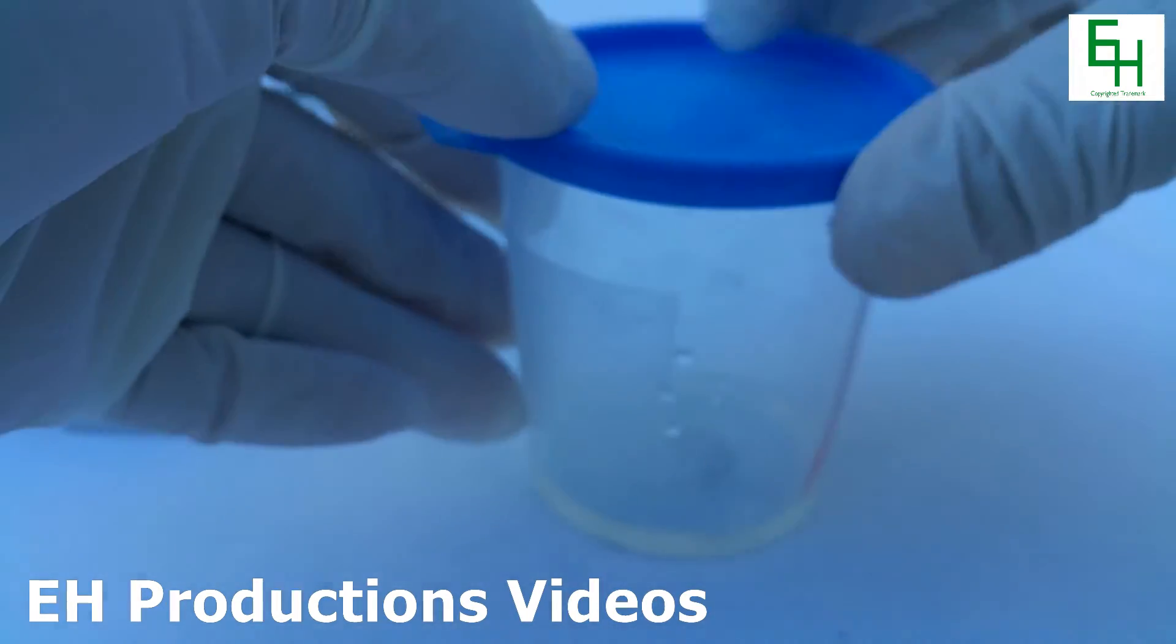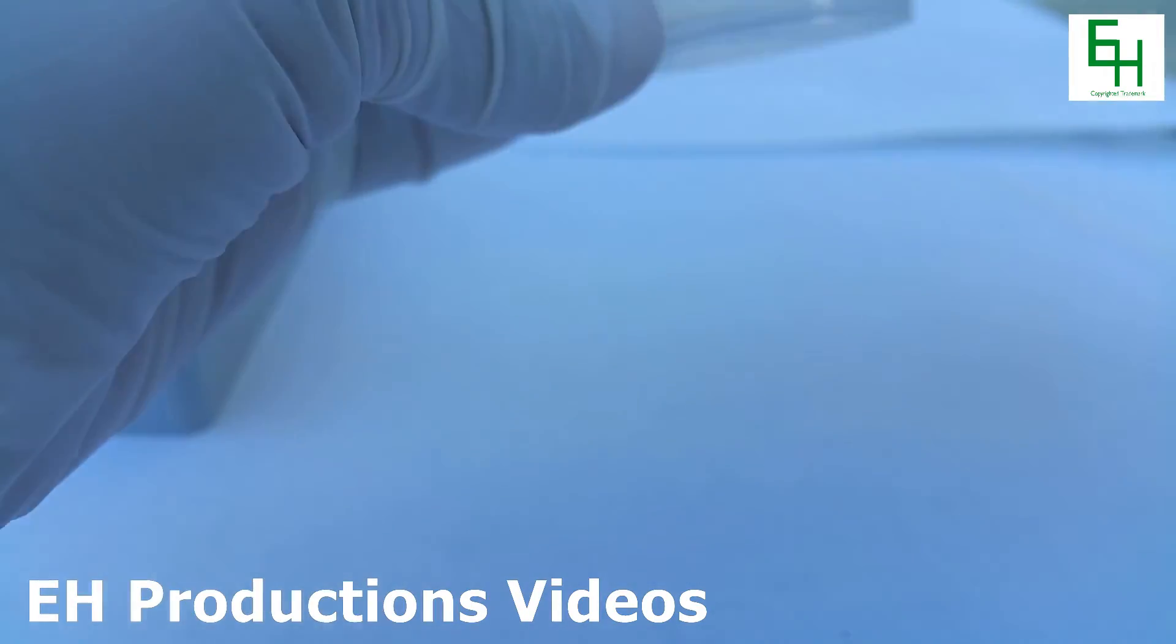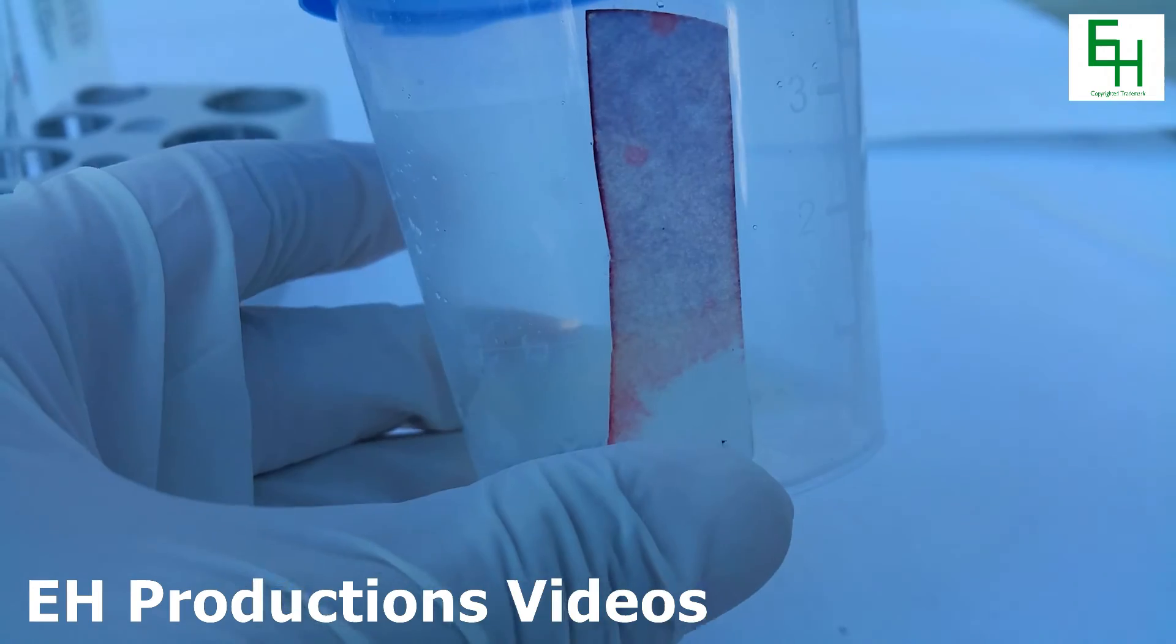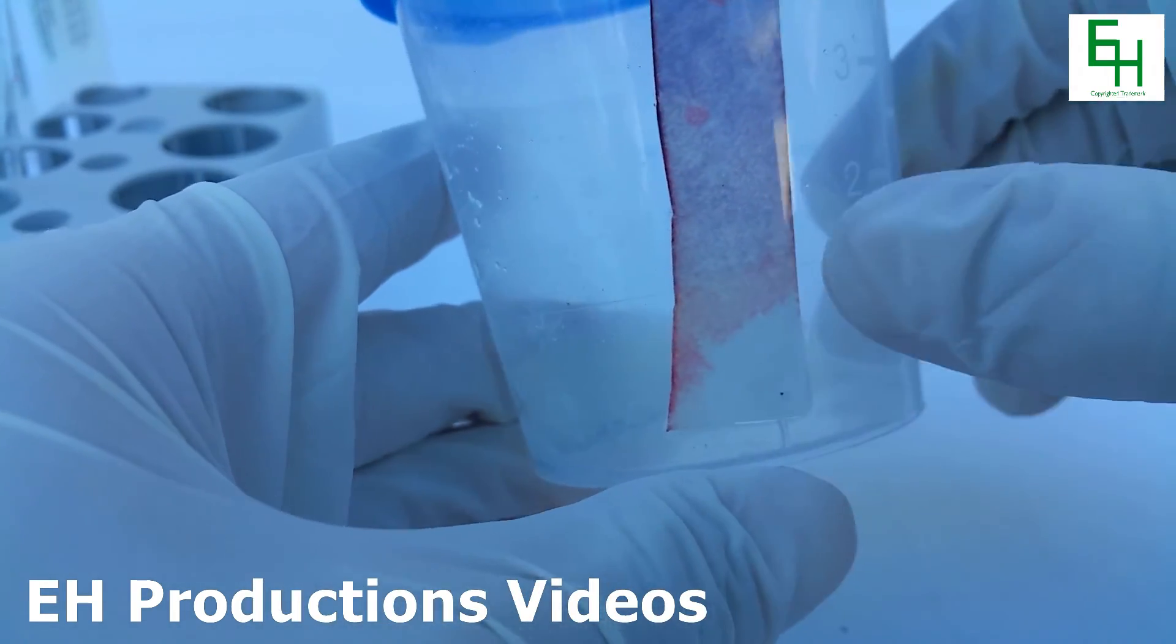I'm going to cap this up again, just like that. Now I can definitely see that it has been bleached pretty well now.